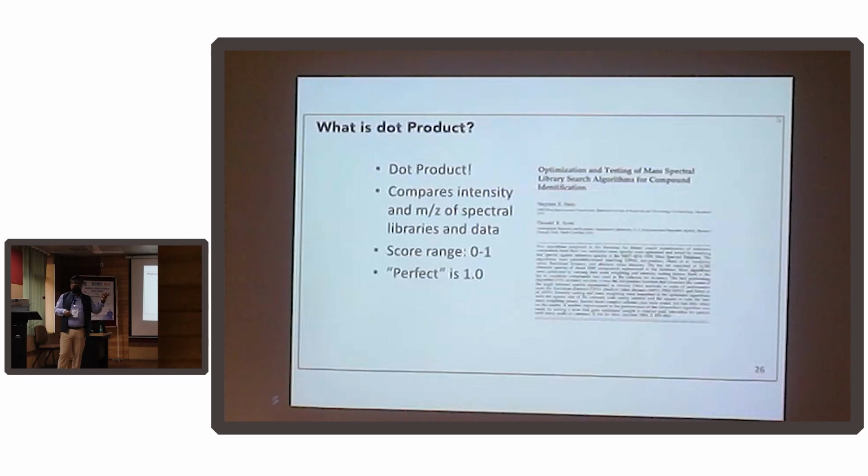Those who are into experiments would realize that whatever is written in the books is fairly different from what you get. So that gives us the dot product value, or dot P. A perfect score is 1. It's a perfect correlation: whatever Skyline predicted, you got.